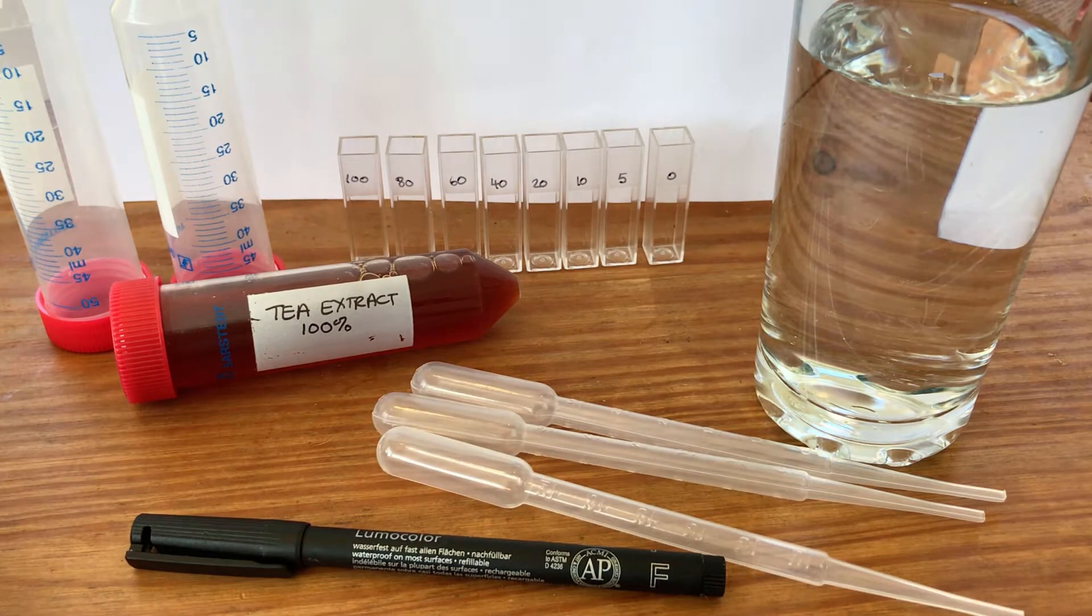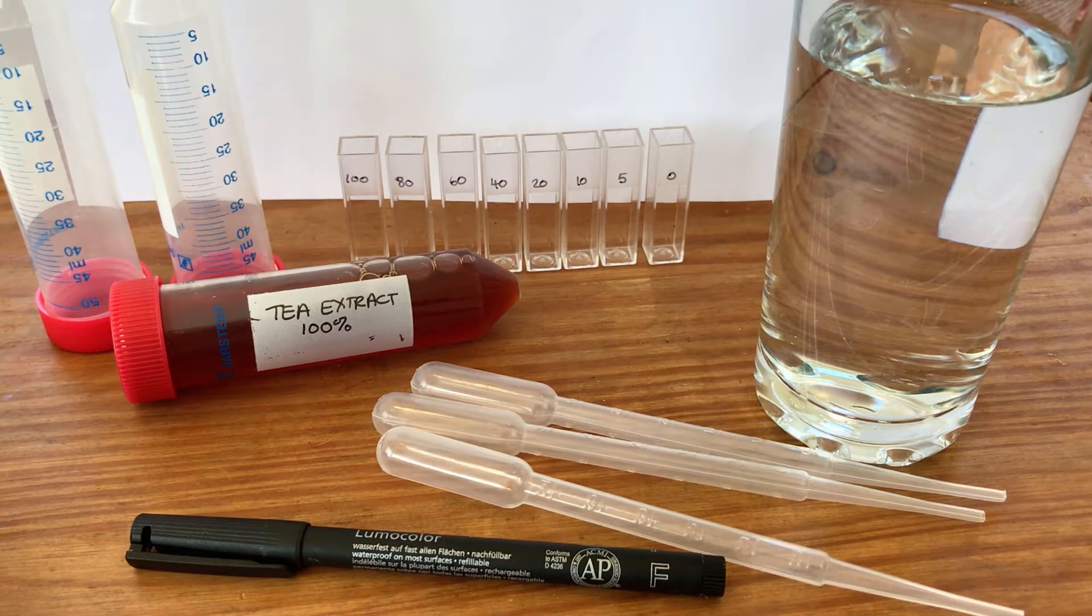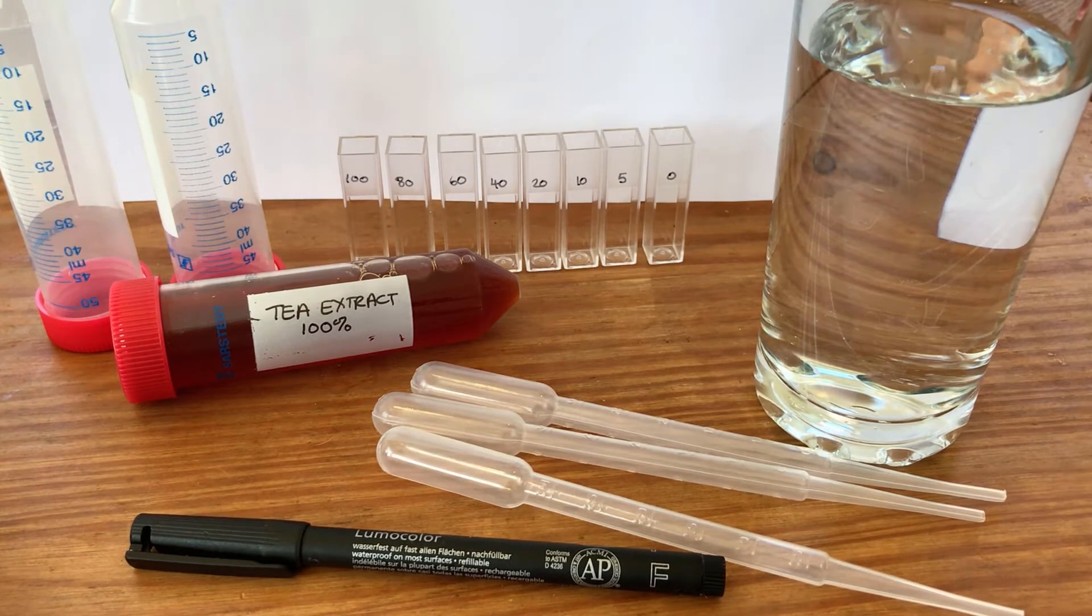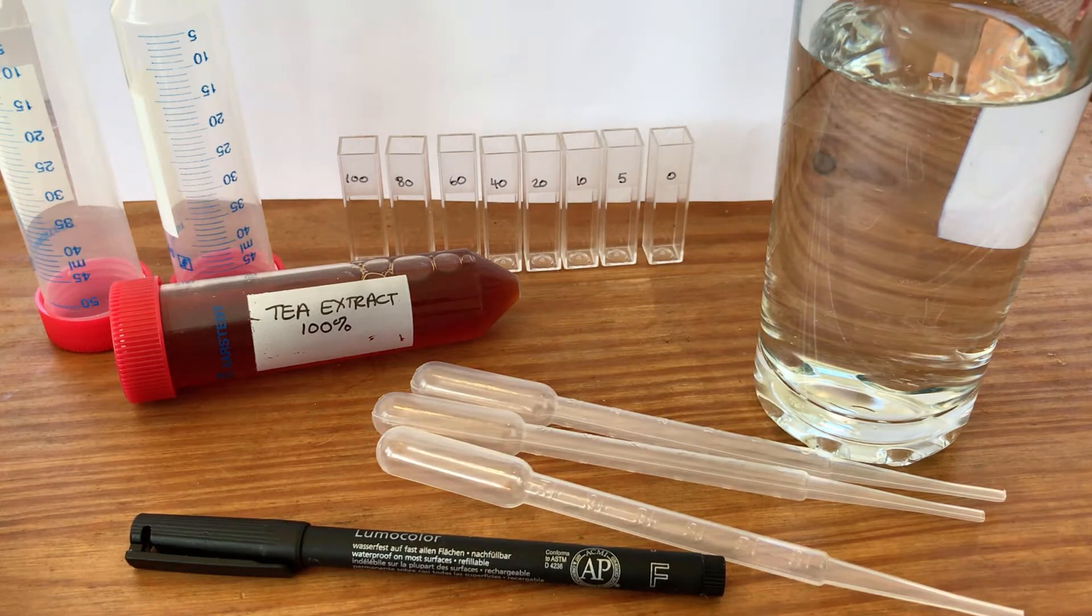I have literally boiled the kettle, made a cup of black tea. I let the tea steep for a minute in about 50 mils of water and I've just put that into the falcon tube, so that's my extract of tea.